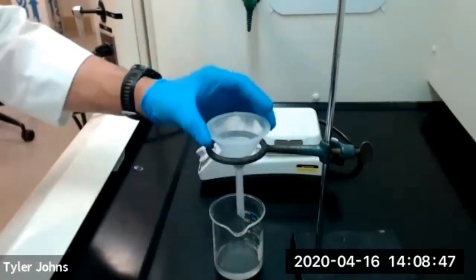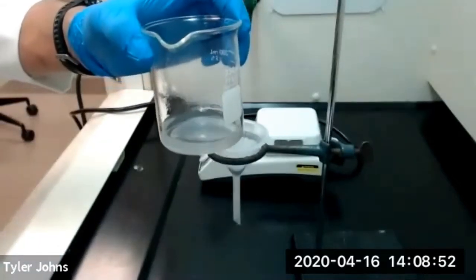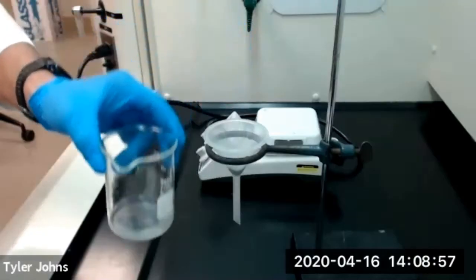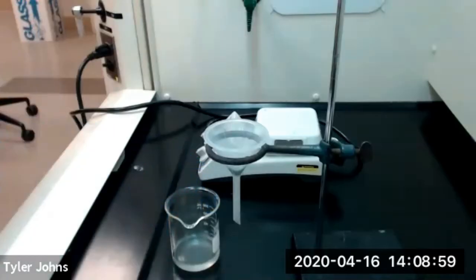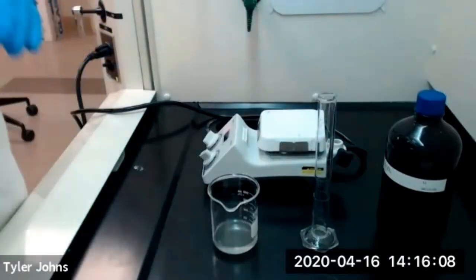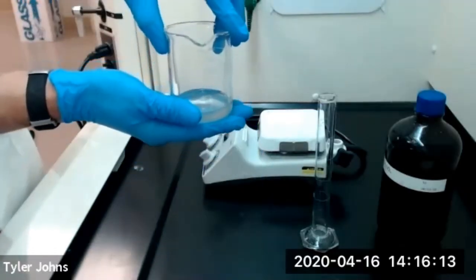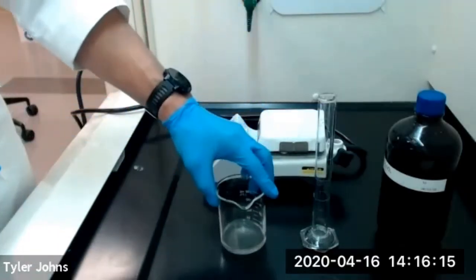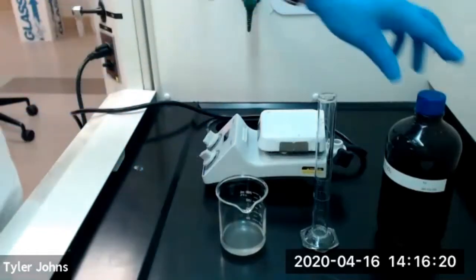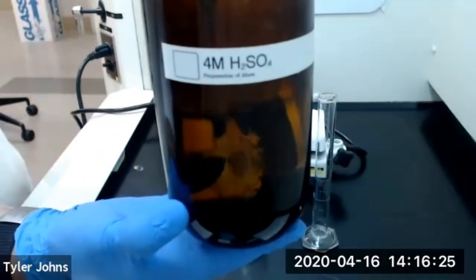So now we're going to take this beaker with the filtered solution and we're going to run some tap water on the outside to cool it down. Okay, so at this point, our solution has cooled down. So now we're going to make the solution acidic with the slow addition of 45 milliliters of 4 molar sulfuric acid.